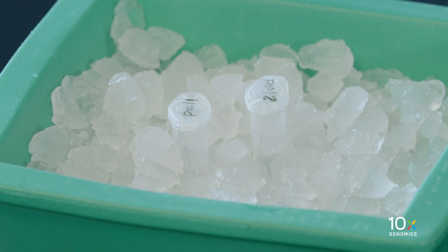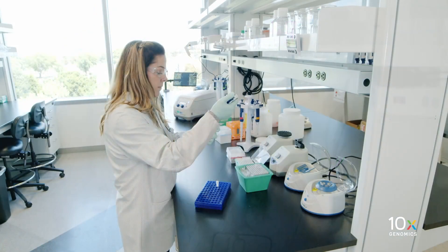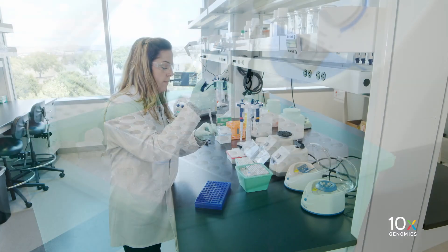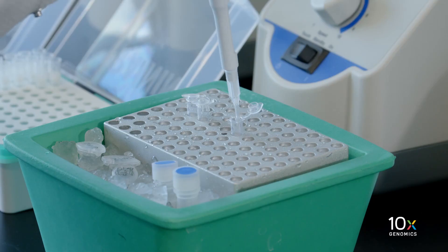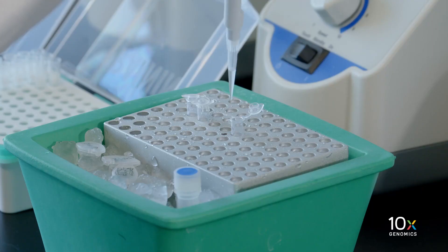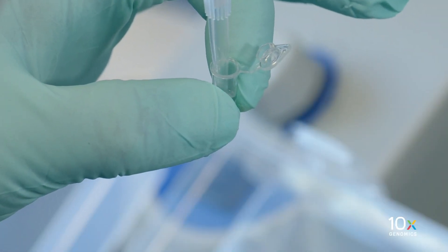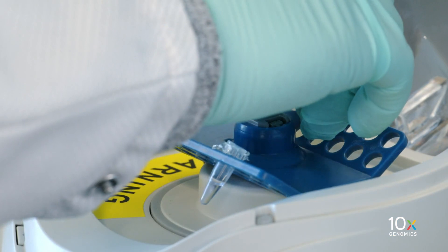Next we will prepare the GEM master mix on ice. Add the reagents in the order listed in the user guide: first add GEM reagent mix, then reducing agent B, then GEM enzyme mix. Pipette mix 15 times and centrifuge briefly.